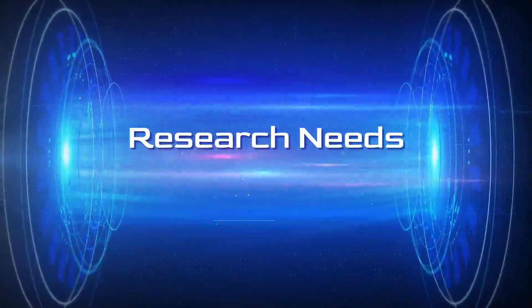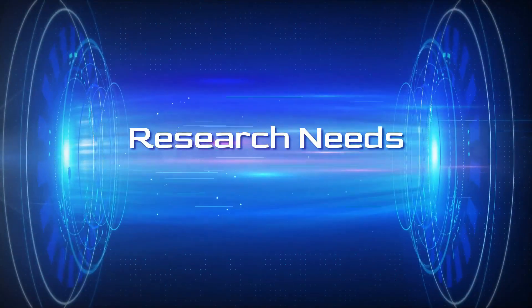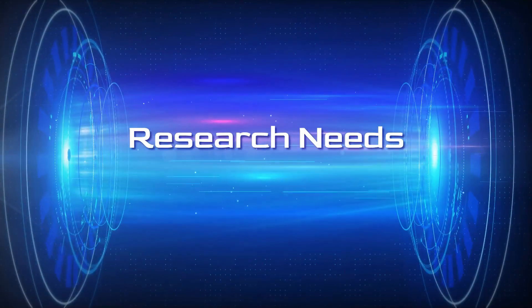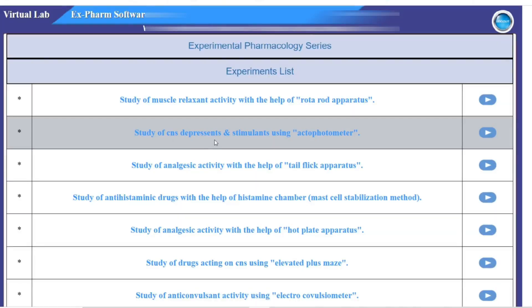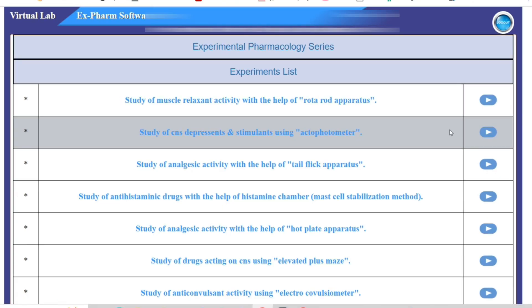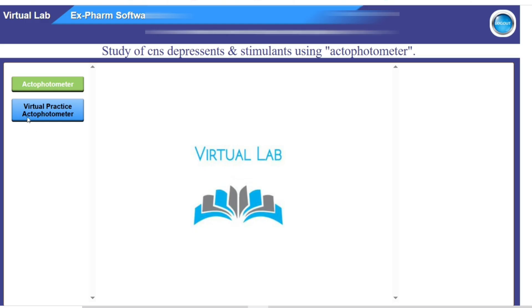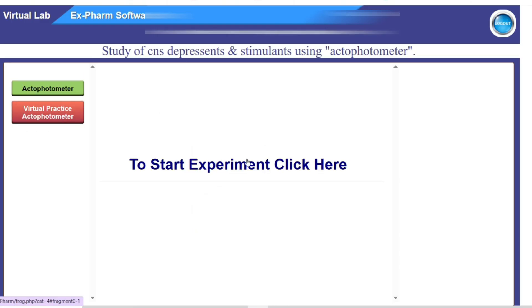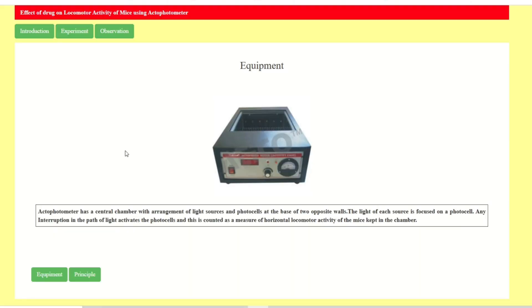Hello friends, welcome to Research Needs. In this video today we will see the study of depressants and stimulants using the actophotometer. We will click and enter into the Ex-Pharm software, then click virtual practice actophotometer and enter to start the experiment.